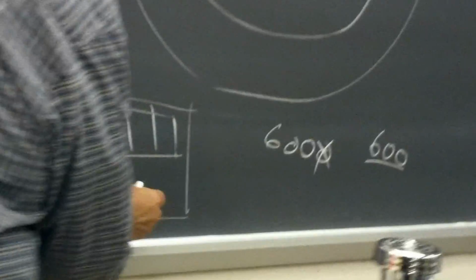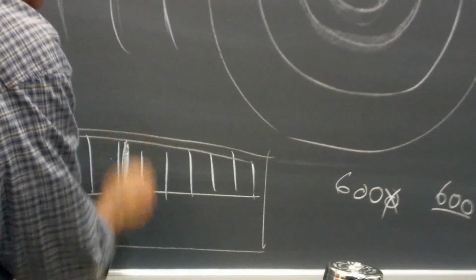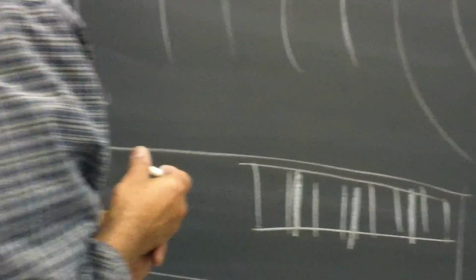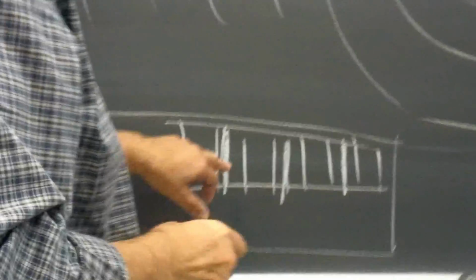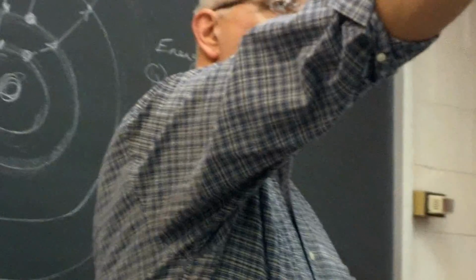Now, you're going to see, for example, a line here, which might be a blue line. You might see over here a yellow line. You might see here a red line. That means that the colors that are being emitted by the lights are, in fact, broken into 3 parts, all right? You can then verify, though. You'll write down the numbers in your report, and the numbers will be indicated by the scale. You'll write down your numbers in the report according to the report sheet that's given to you in the lab book. And then you'll check those numbers against the little picture in the back of the room there, which shows you the spectrum for hydrogen and helium.